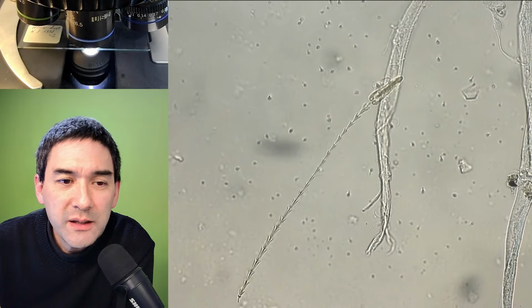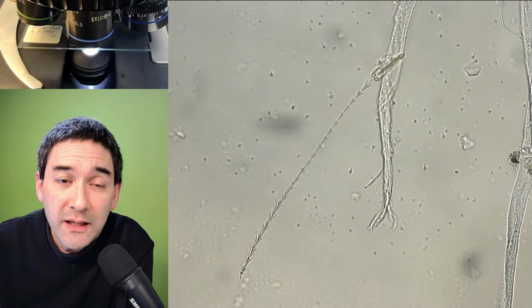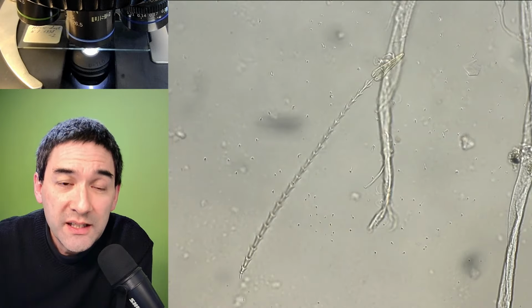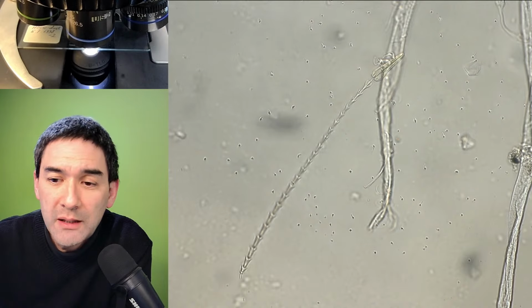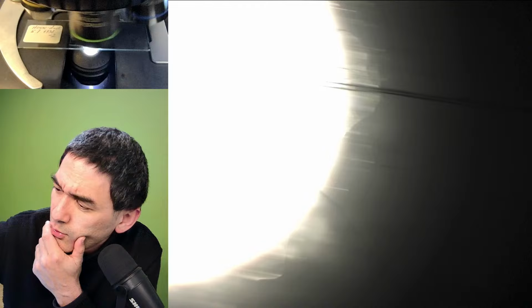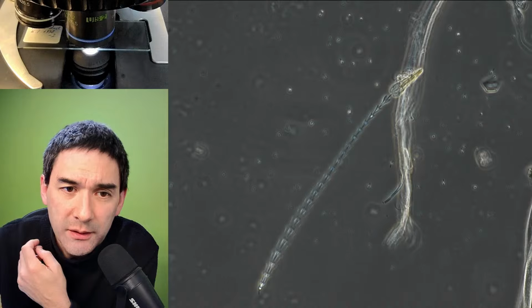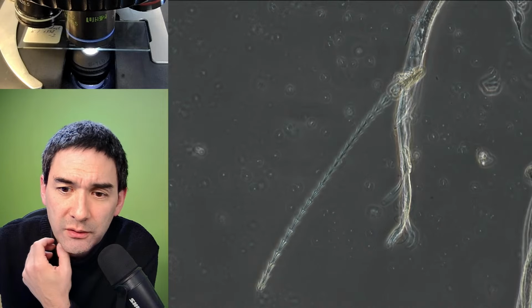Here it is. So that was actually the first time I found this in the dust, and I had absolutely no idea what in the world it was. That's basically the picture that I made here. Let's try phase contrast, just for the fun of it.